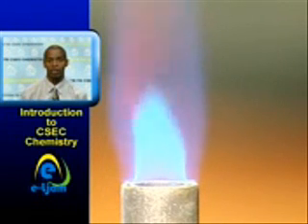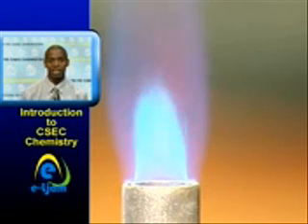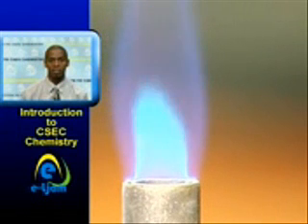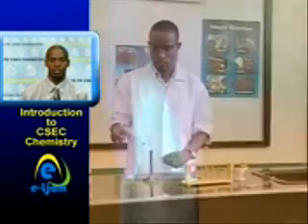The hottest flame is called the roaring blue flame. It is characterized by a light blue triangle in the middle, and it is the only flame of the 3 which makes a noise. It burns at approximately 700 degrees Celsius.